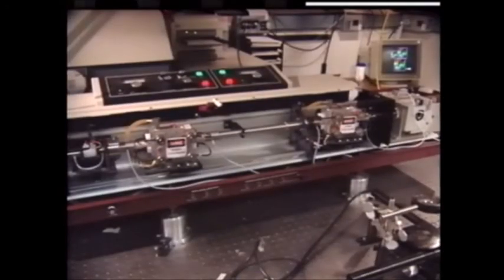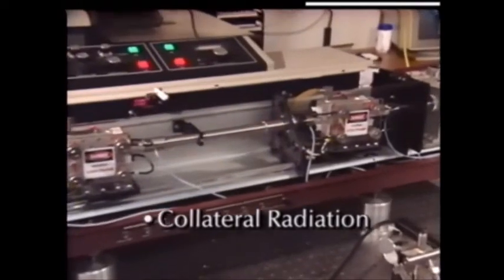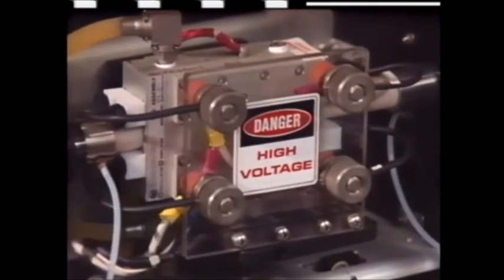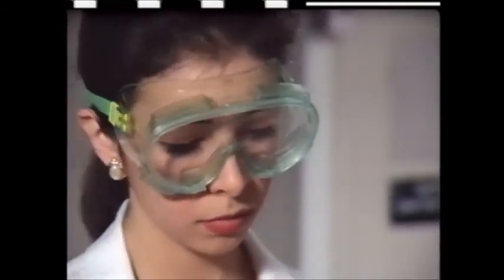Whenever you remove the protective housing of an optically pumped laser, you risk potential exposure to collateral radiation, as well as the beam. Leakage of light from the optical cavity may expose you to high levels of visible and ultraviolet radiation. Wear personal protective equipment, including eyewear that protects you from ultraviolet radiation.